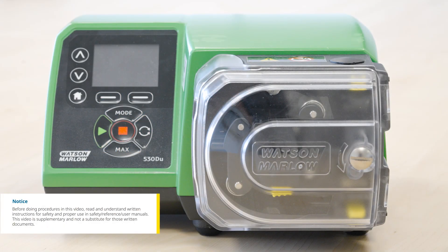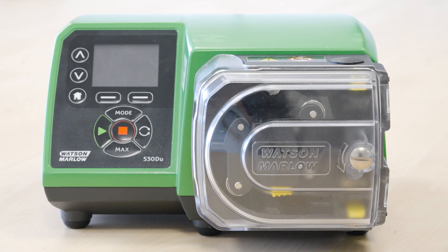In this video we are going to show you how to calibrate an analogue signal on the Watson Marlow 530 peristaltic pump. During this process the pump may run — ensure that it is safe to do so.